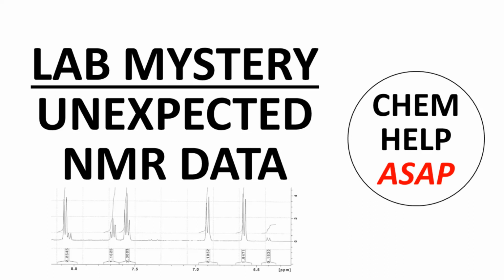This video describes a recent reaction in which I encountered a mystery concerning the reaction product. During the experiment, I relearned the valuable lesson on the danger of making assumptions about your data. I'll walk through the story. Maybe you can figure out the mystery more quickly than I did.